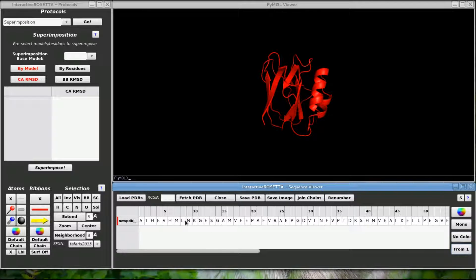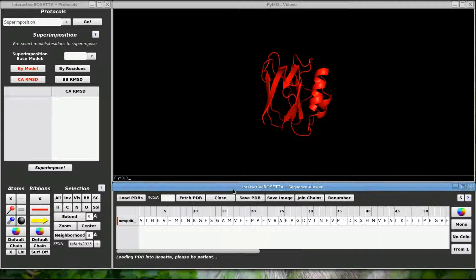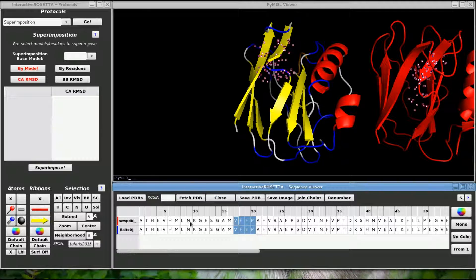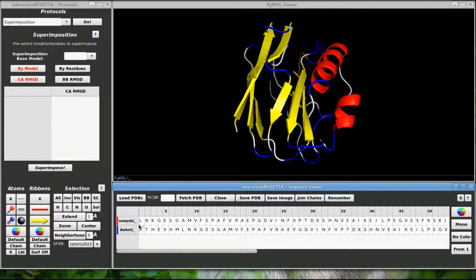Let's load another structure. This button will join two selected chains together into one chain. The renumber button will take a single residue selection and rewire the sequence such that the selected residue is the N-terminus.